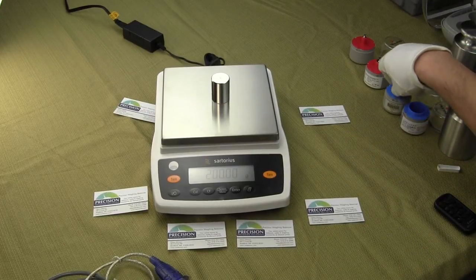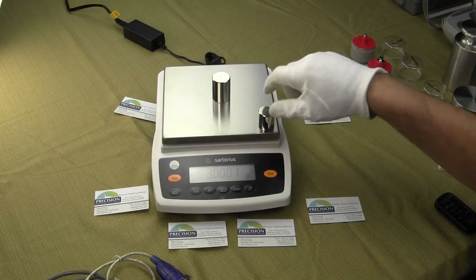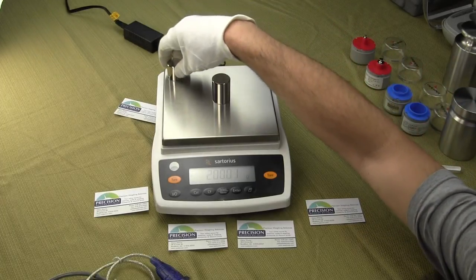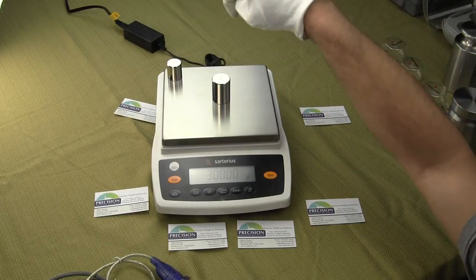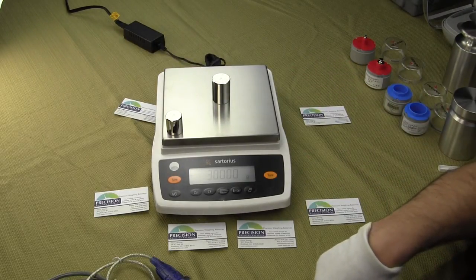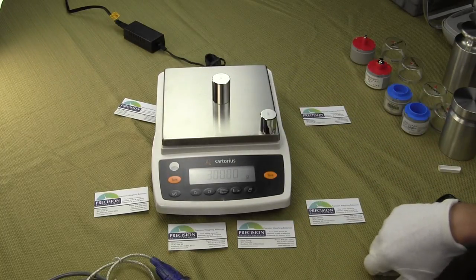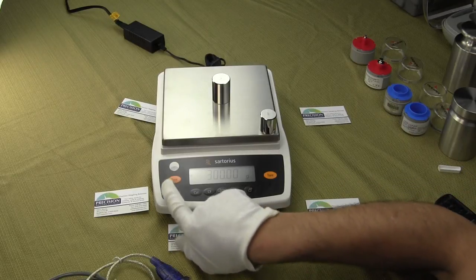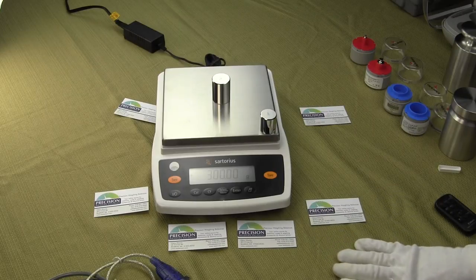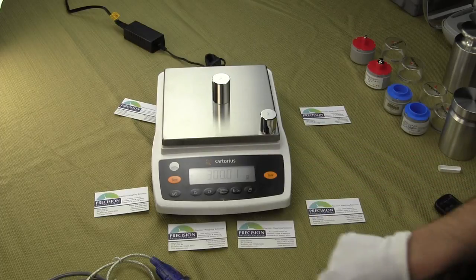I'll just put some weights on this balance so that you get some idea of the performance and how quick the balance is. We'll just go to all four corners — this is what we call eccentric load-in. We made a short video showing the eccentric load-in; you might want to watch that on YouTube — there's another video on the Entrance Series. It's a very quick balance. You'll notice in the upper left-hand corner we have a spirit bubble so that you can level your balance — the balance should always be level.